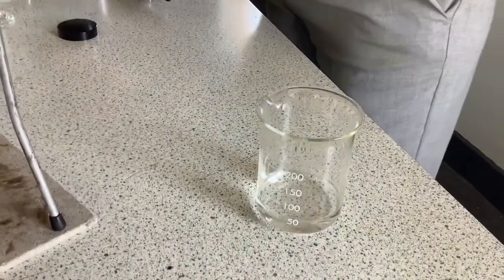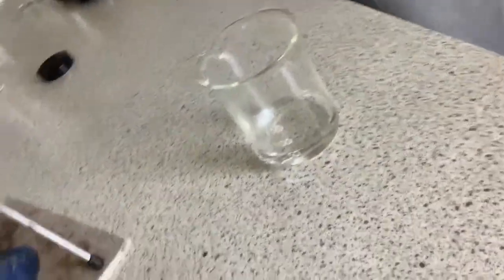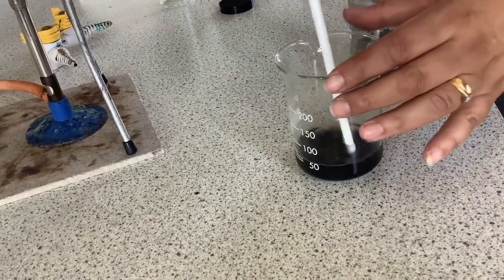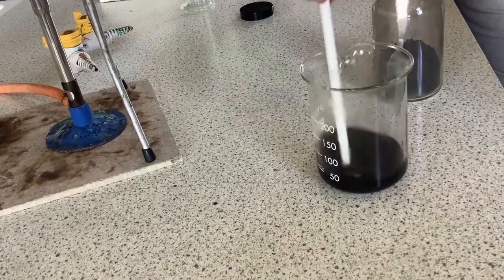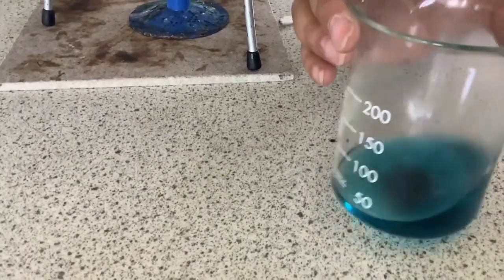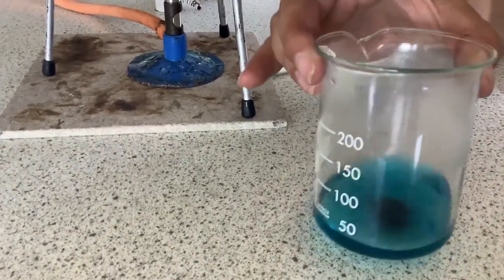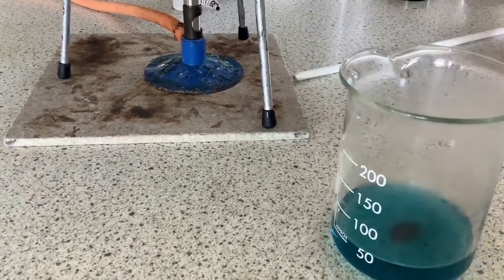And we are now going to add copper oxide. Now we need to do this until the copper oxide is in excess. And we'll know this because it will stop reacting. I'll give it a stir. So you can see now that we have a blue solution, so we've seen a change in colour, and we still have some of the black copper oxide in the bottom of the beaker, so that tells us that all the sulfuric acid has reacted with the copper oxide.